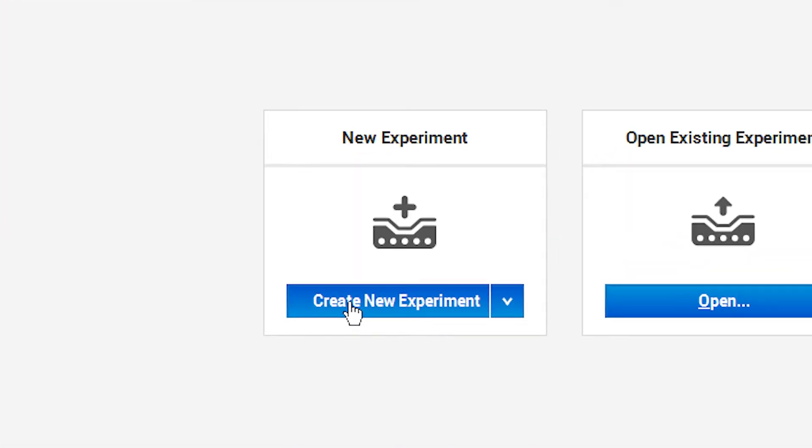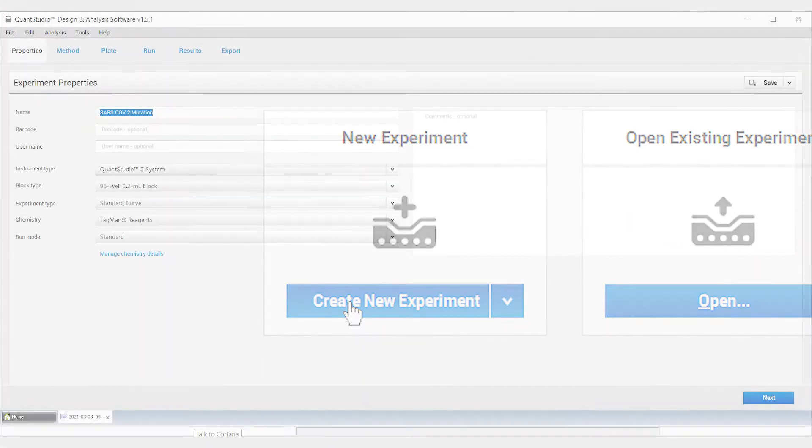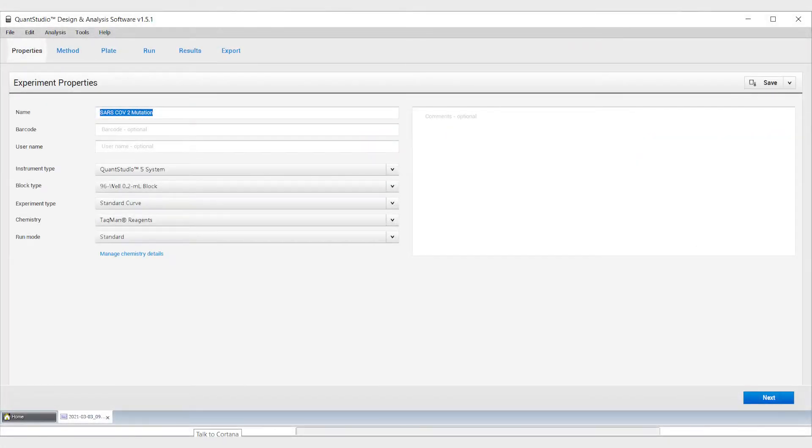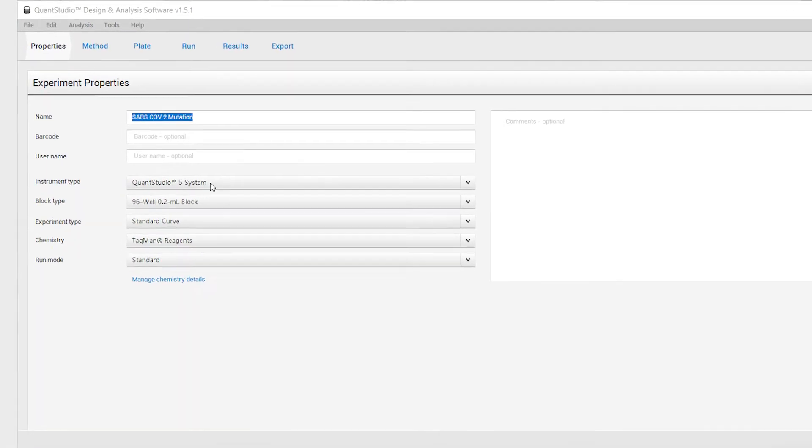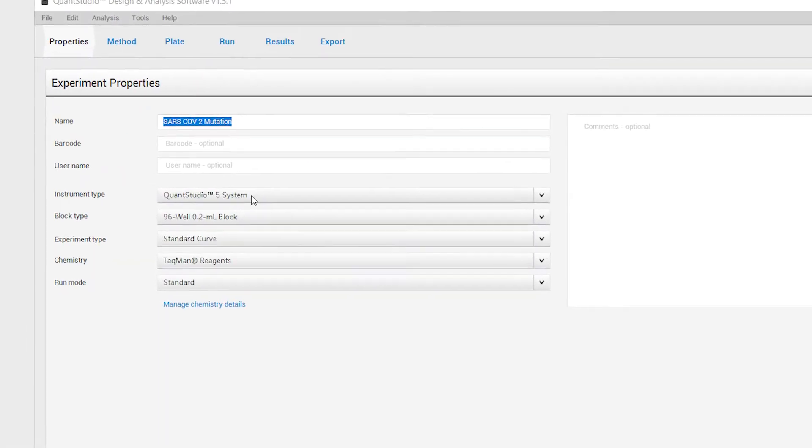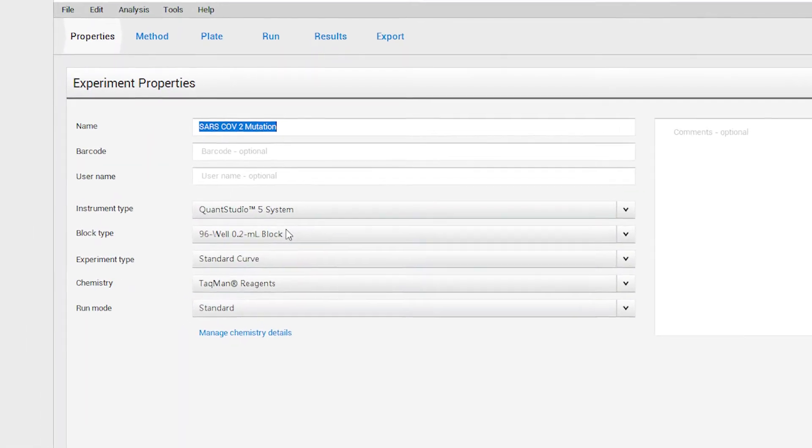Select Create New Experiment. Under Properties, create a name for your experiment, and then select your instrument type and your block type.